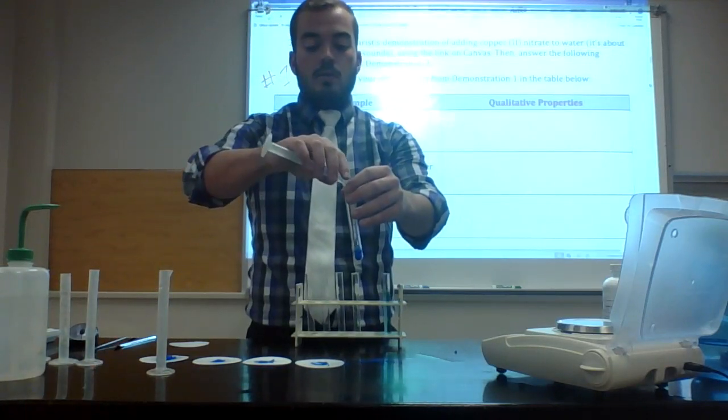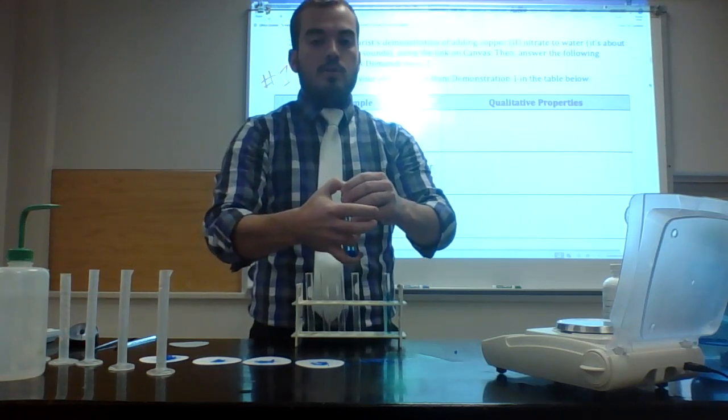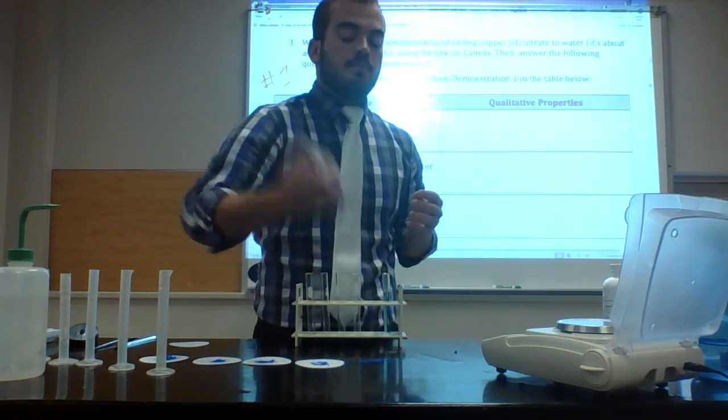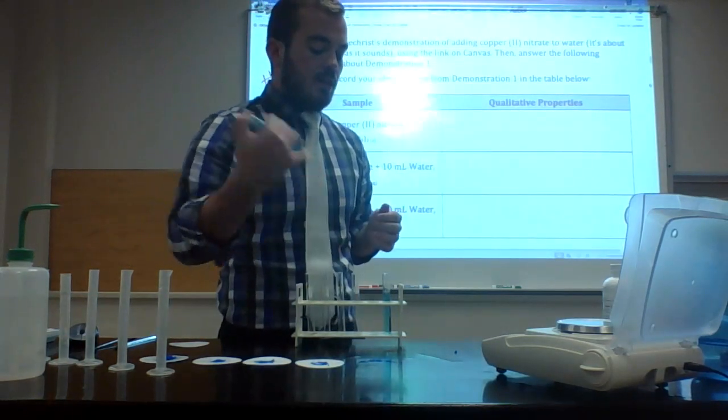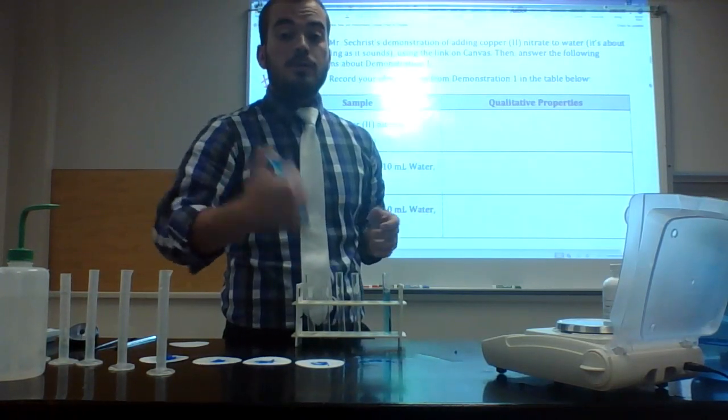Next we're going to do 2 grams of the solid with 10 milliliters of water. Put it together, shake it all up. This will take a little bit longer to dissolve. Thanks for your patience.